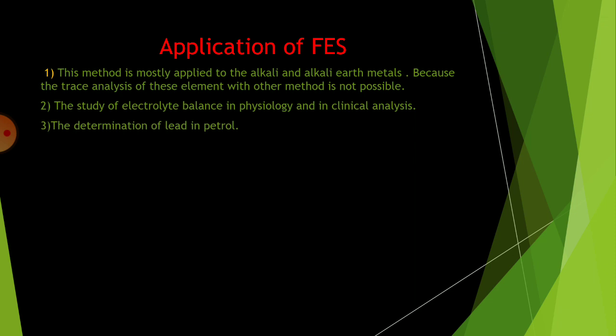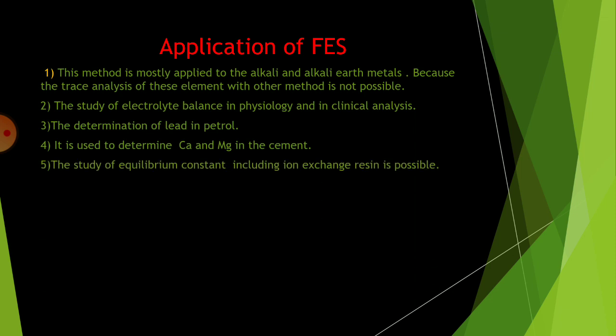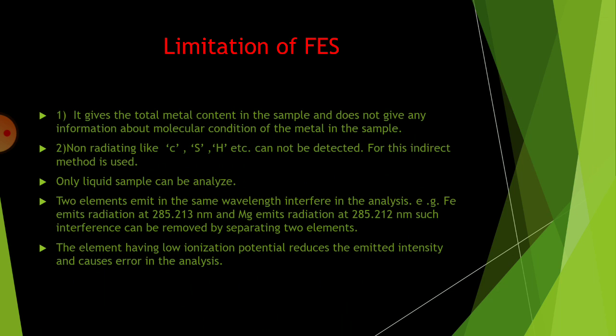Then the determination of lead in petrol can be easily done with FES. It is used to determine calcium and magnesium in cement, and the study of equilibrium constants, including ion exchange resin, is also possible with it.